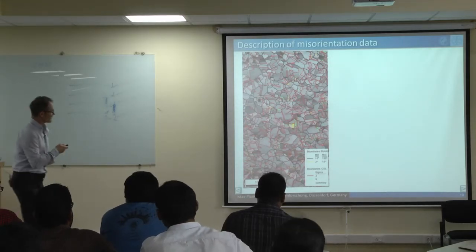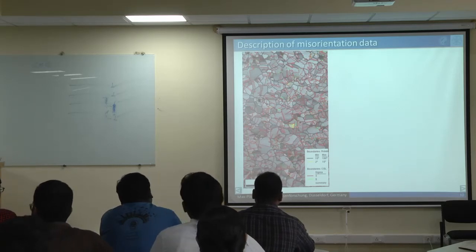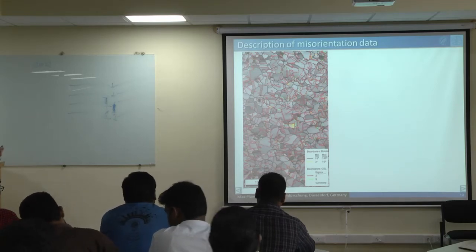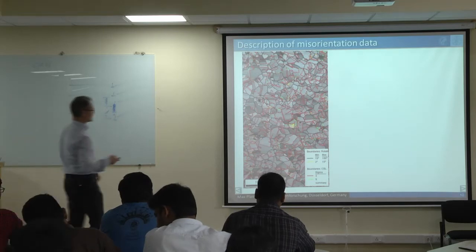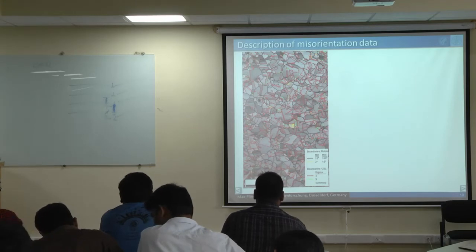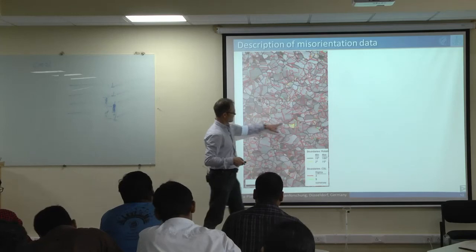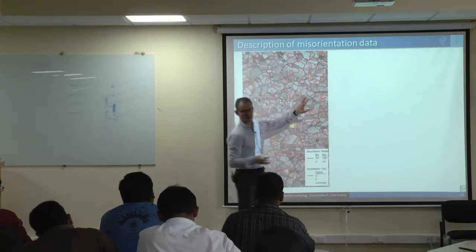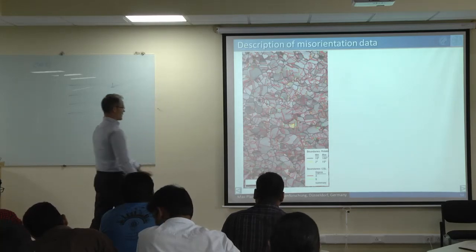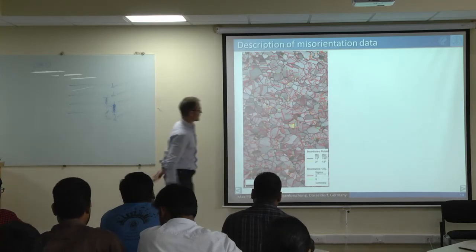Yes, I want to. This is an EBSD map of, what is that material? Some austenitic stainless steel, I think, or nickel superalloy, I don't know. So at least FCC. I don't remember what it is. And I have plotted all grain boundaries in here. In black, just general large angle grain boundaries. In yellow, very few of them, just general small angle grain boundaries without taking care of what kind of axis they have. And in red, sigma 3, and in green, sigma 9 boundaries.